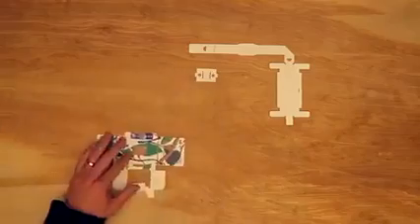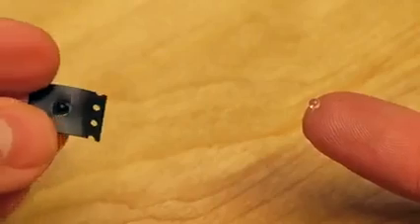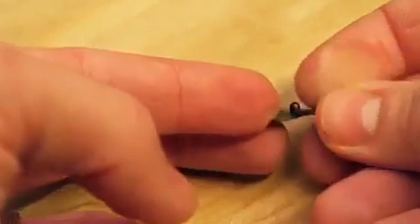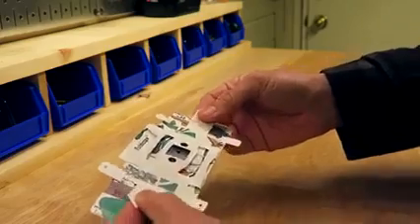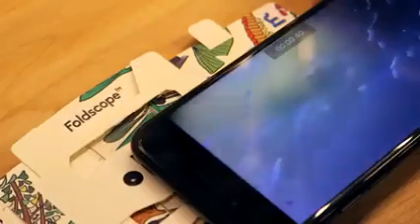It comes like this, and then you pop out the pieces of paper and follow the simple instructions like folding origami. The lens is actually a tiny sphere of glass embedded in this plastic. You put your slide in here, then you look through that tiny glass sphere and it's magnified 140 times. You can even put your phone up to it and film and capture video like this.